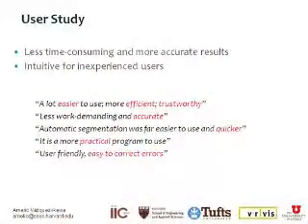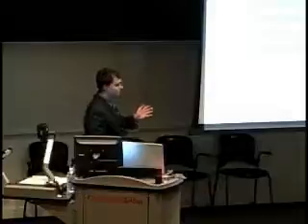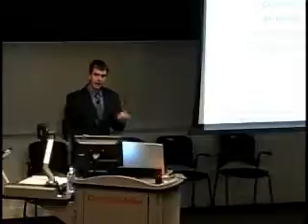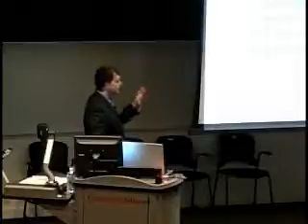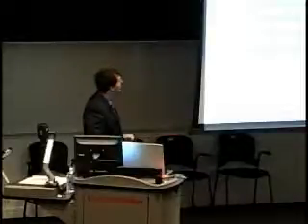So this is some of the feedback we get from the users that use NeuroTrace. NeuroTrace is a lot easier to use than other tools like Reconstruct. It's more efficient, trustworthy, and, very important, it's easy to correct errors with NeuroTrace. Because if there is any error, the user doesn't have to redraw the outline for every cross-section of the neuron. She can just brush the elastic band on some cross-section, and the computer will propagate the solution to trace the neuron completely.